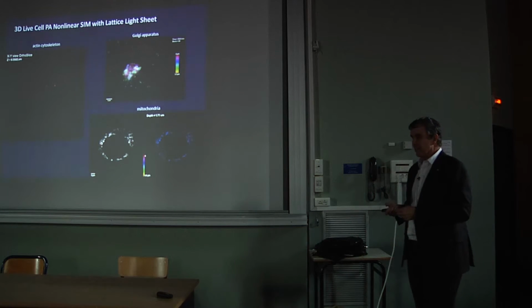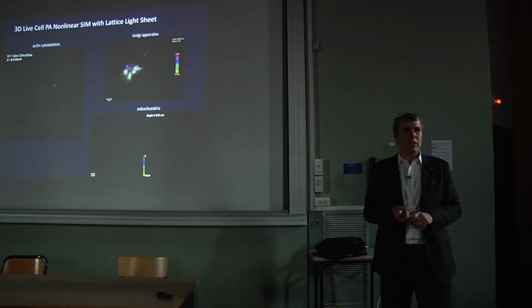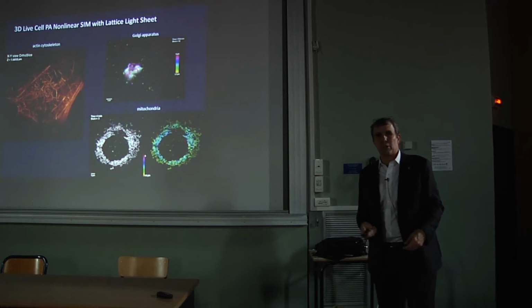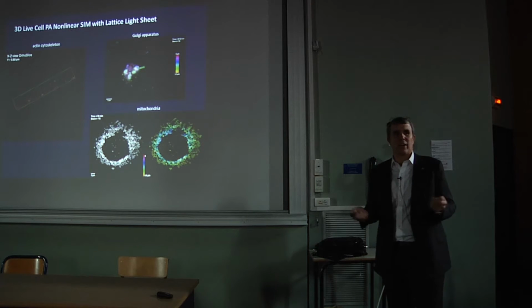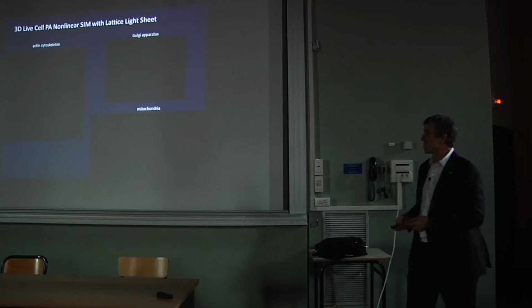But really this technique is very difficult to do because it takes 20 to 30 seconds minimum to get an image versus sub-second in the two-dimensional case. And of course, you're throwing much more light at the specimen in order to work your way through the whole thing. So whether this has any real legs for biology, I'm not sure. We did it primarily as just a demonstration.